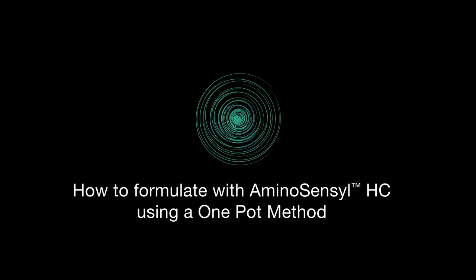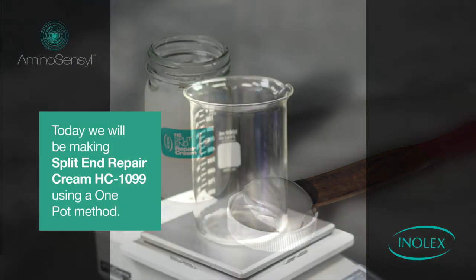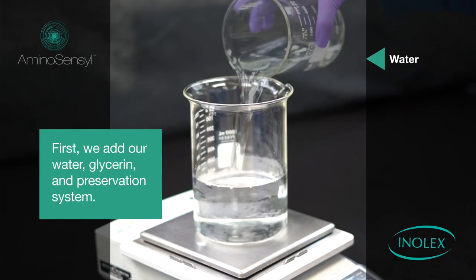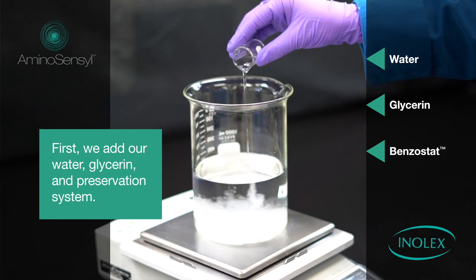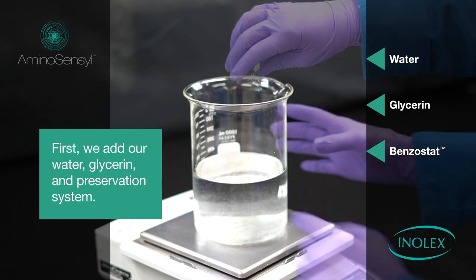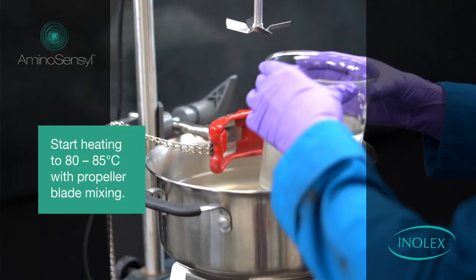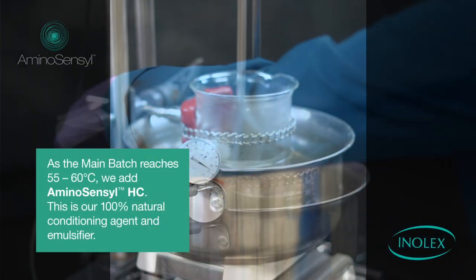How to formulate with Aminosensil HC using a one-pot method. Today we will be making a split end repair cream. First, we add our water, glycerin, and preservation system. In this formula we use Benzostat, a broad-spectrum alternative preservation system. Start heating to 80 to 85 degrees Celsius with propeller blade mixing.